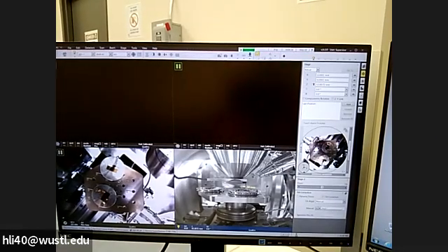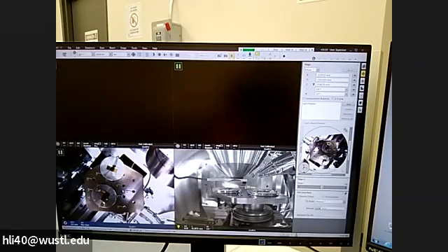Now, if we look at the quarter screen here, you will see the two metal samples I loaded in. You can also see a cross here. The cross is the place you're going to view with the electron beam. If you like to see your sample, I would drag the cross to my sample. You can either drag this cross to this place or double click. For example, I can drag this to here, and it will move to the place. Or you can double click.